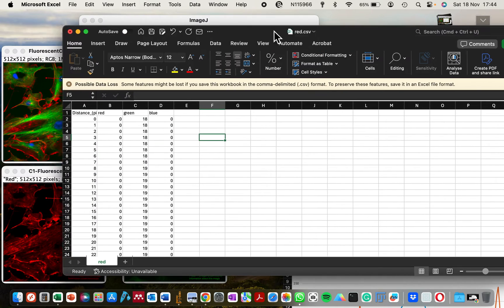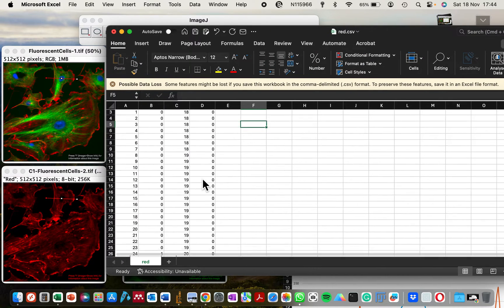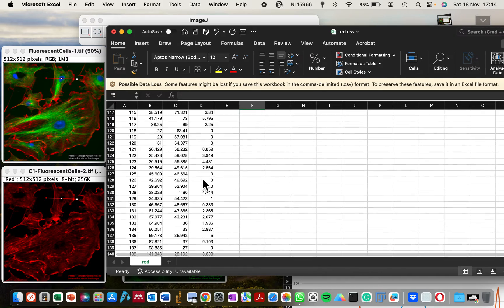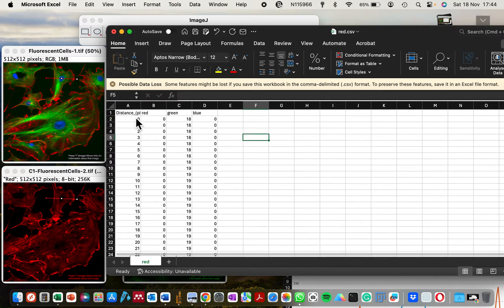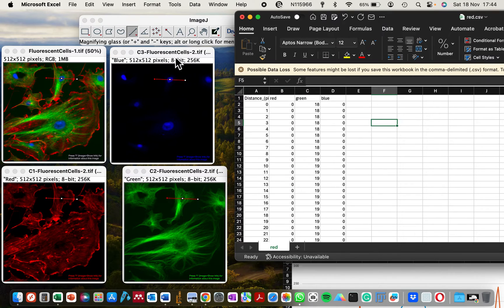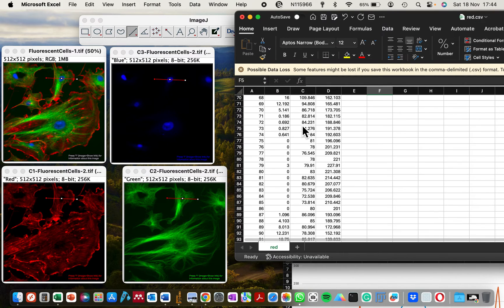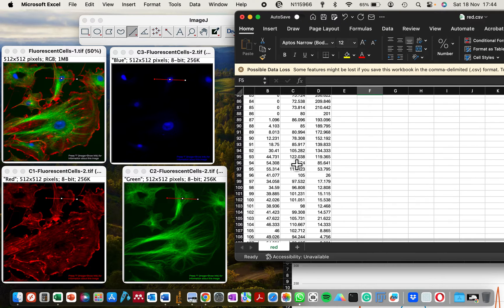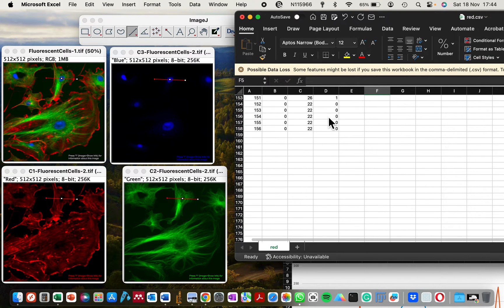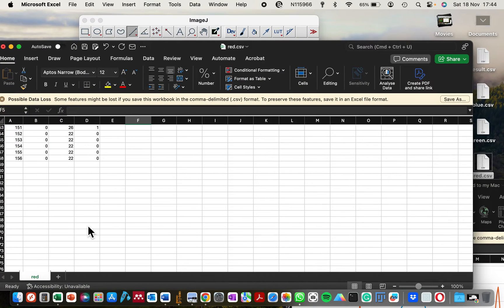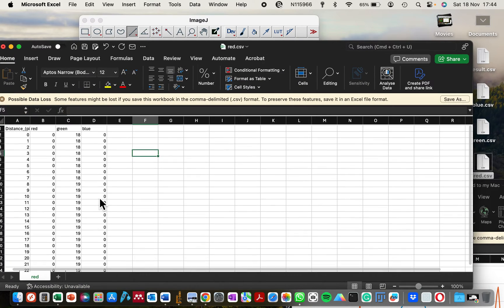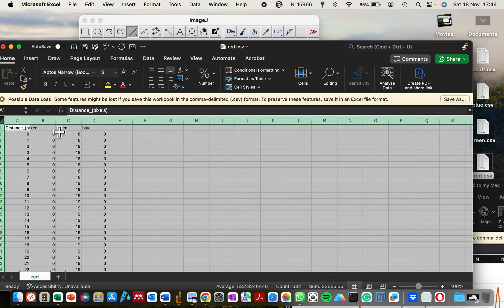I'll close the other Excel documents to avoid confusion. Once you have the three datasets together, check that they all have the same length — the same number of data points, meaning the same pixel distance from start to end. You can see they are uniform because we didn't change the length of our region of interest.